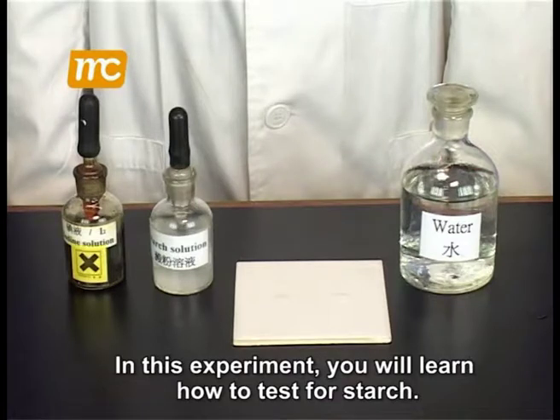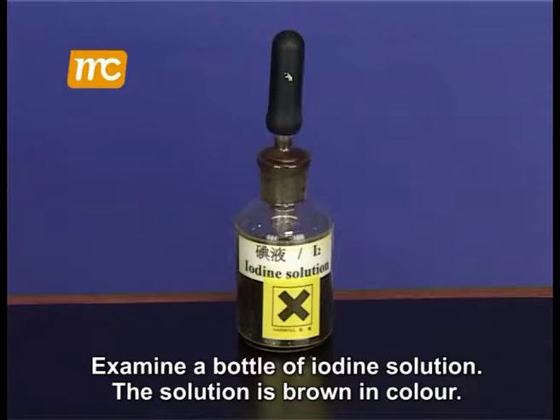In this experiment, you will learn how to test for starch. Examine a bottle of iodine solution. The solution is brown in color.